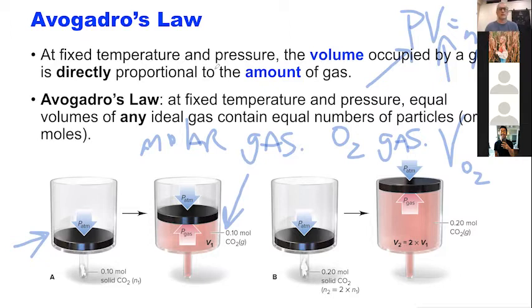Are we using the gas constant? No, we're not, because you're going to be calculating the gas constant. We need to know what the pressure is. How are we going to determine what the pressure is? How do we measure the pressure inside that inverted graduated cylinder? Because we need that pressure in order to measure R. How are we going to figure that out?